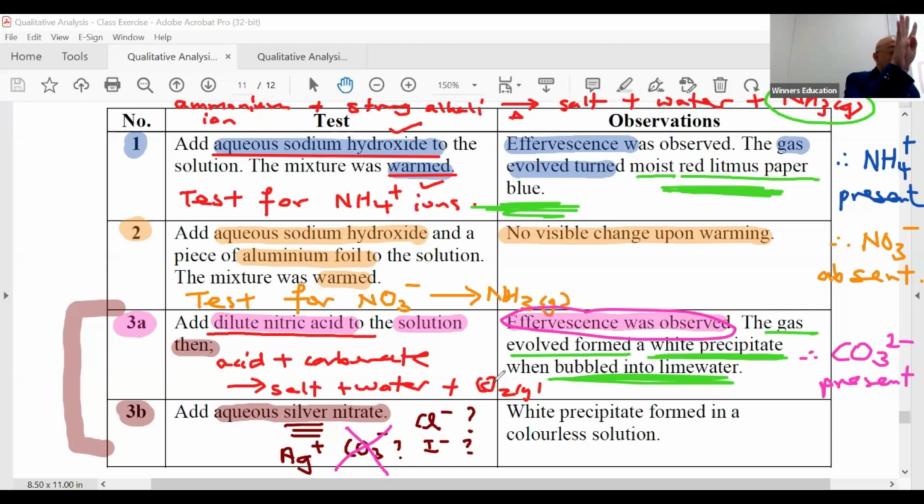But if it's a new tube, called tube number 4, it could be carbonate. Make sense to you? I keep quiet for 30 seconds. Practical, and we'll do the rest of the practical. Okay, ready?